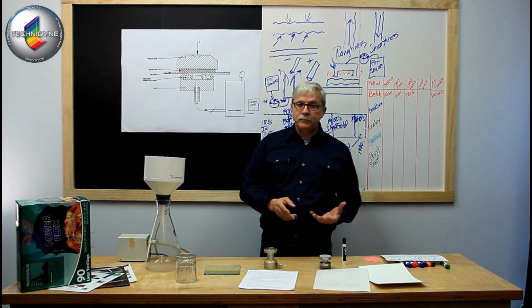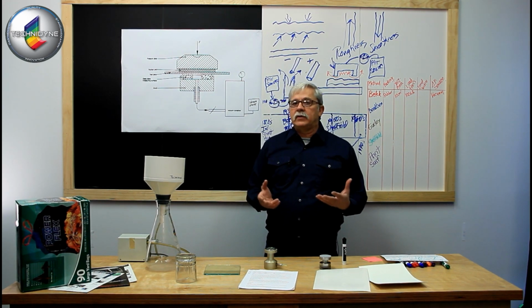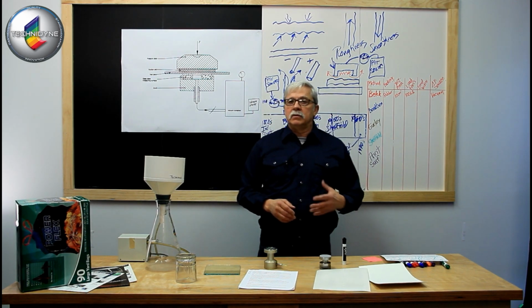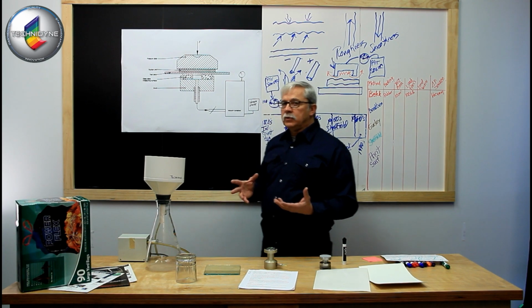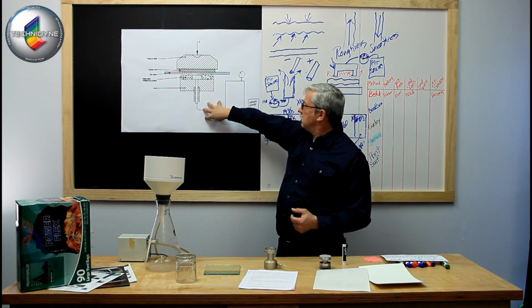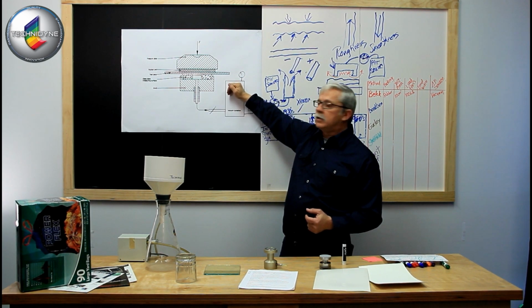All right, that's all well and good, but now how do I quantify that to bring it to my production people and let them use those numbers to make better paper or to continue to make good paper? The way I do that is, as I mentioned, I evacuate, shut off my valve, and evacuate this to a fixed negative pressure.